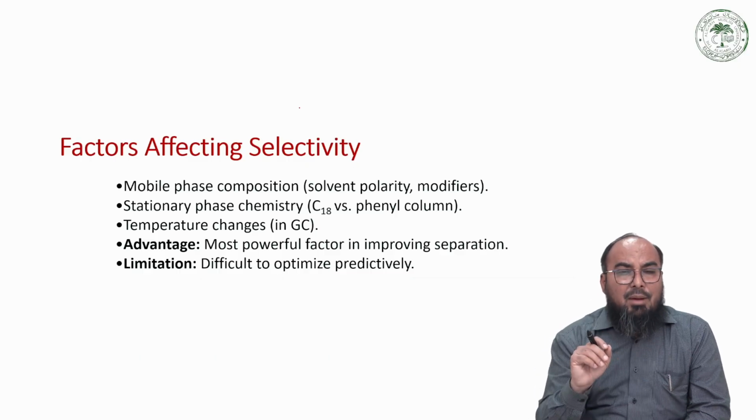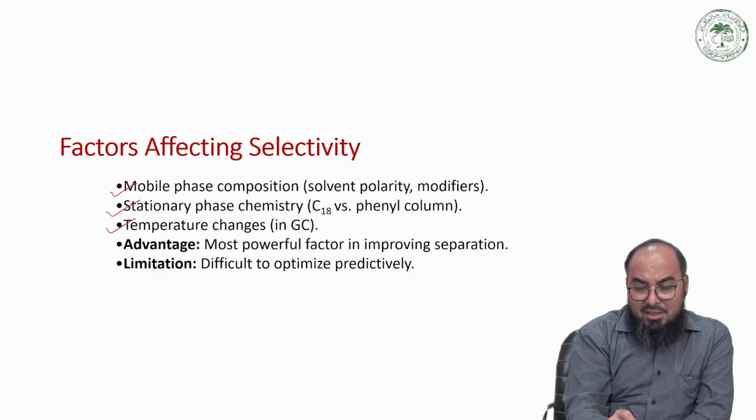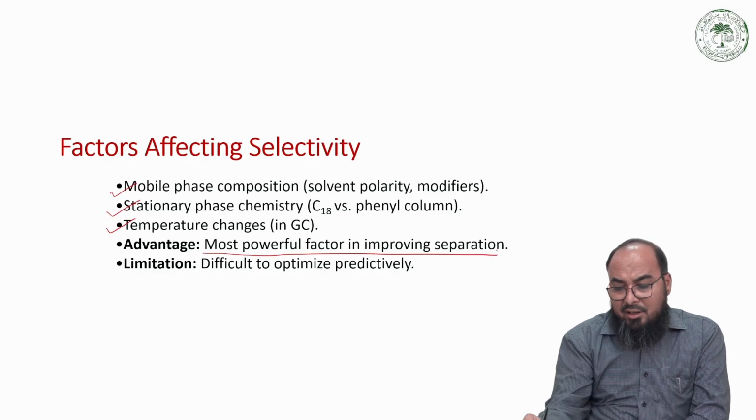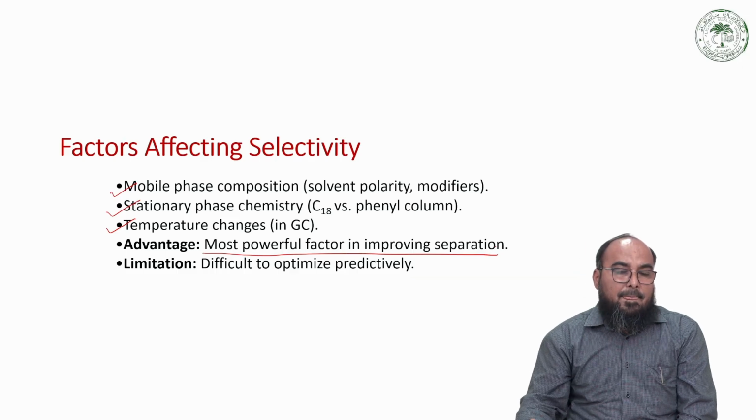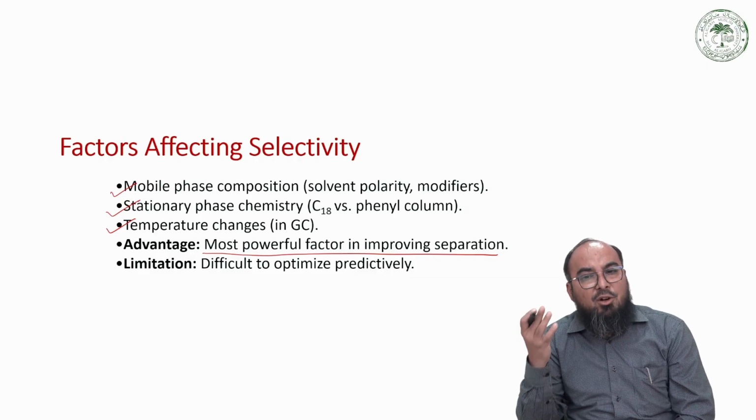So what are basically the advantages of this? The first advantage is it is one of the most powerful factors in improving the separation. On the basis of the value, you decide whether you have achieved a good separation or not.